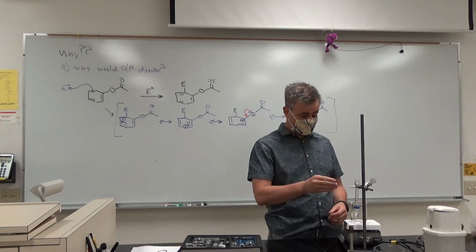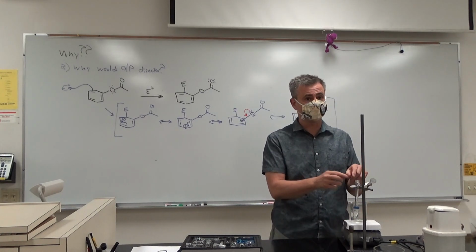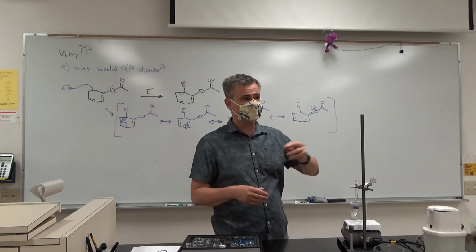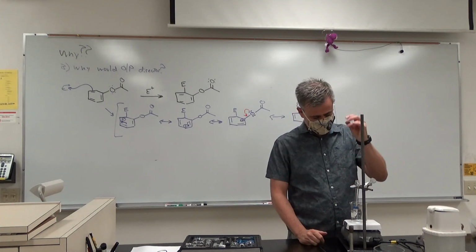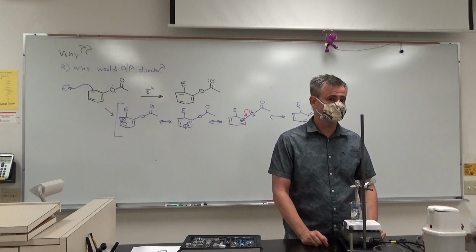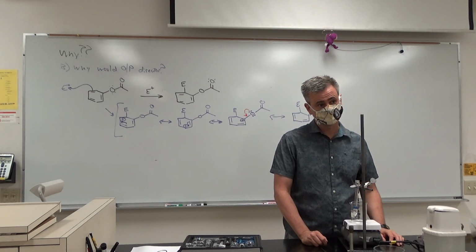And then when we go to add it, you want to hold that beaker with the test tube right next to the mouth of this. You don't want to hold it over here and dribble sulfuric acid, nitric acid all over the place. And you're going to use a long pipette and add it carefully directly down the air condenser. Does all that make sense, guys? Questions? Let's do it to it.